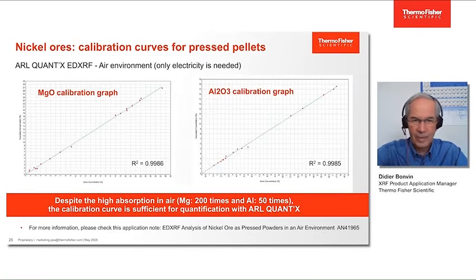The drawback would be that sodium then would not be possible in air, because then the absorption is closer to 2,000 times compared to the 200 times absorption that we experience for magnesium.